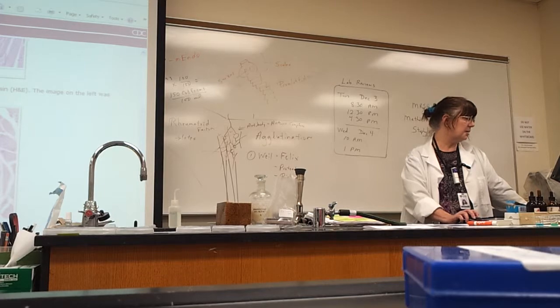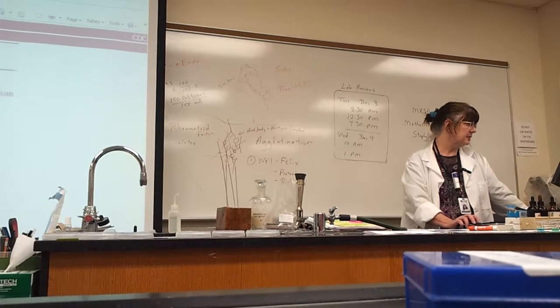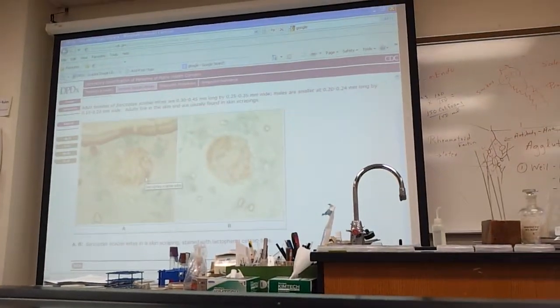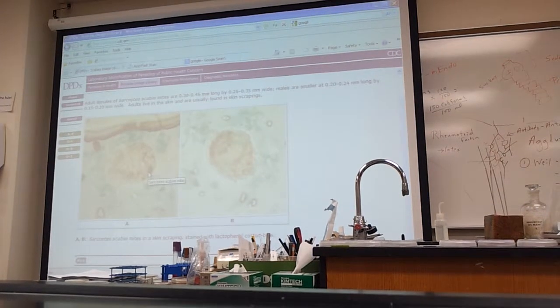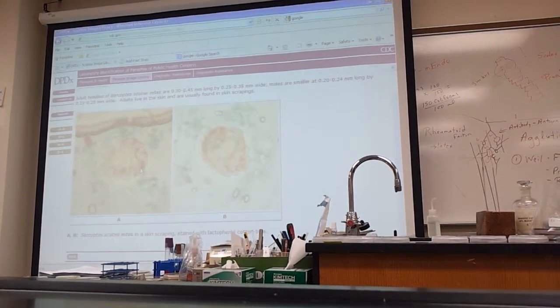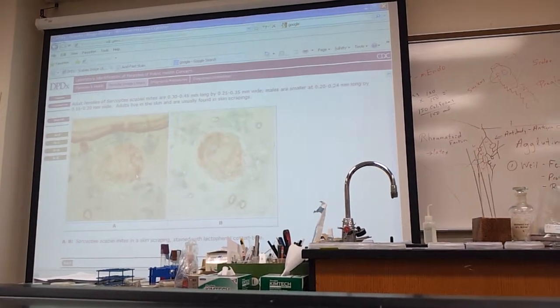I want to do Sarcoptes scabiei. Okay? Sarcoptes, there's Sarcoptes. We have an excellent slide back there. Little teeny brown, it looks to you like little brown circles. Little brown circles outside the skin, little brown circles going into the skin, little brown circles that burrow into the skin.